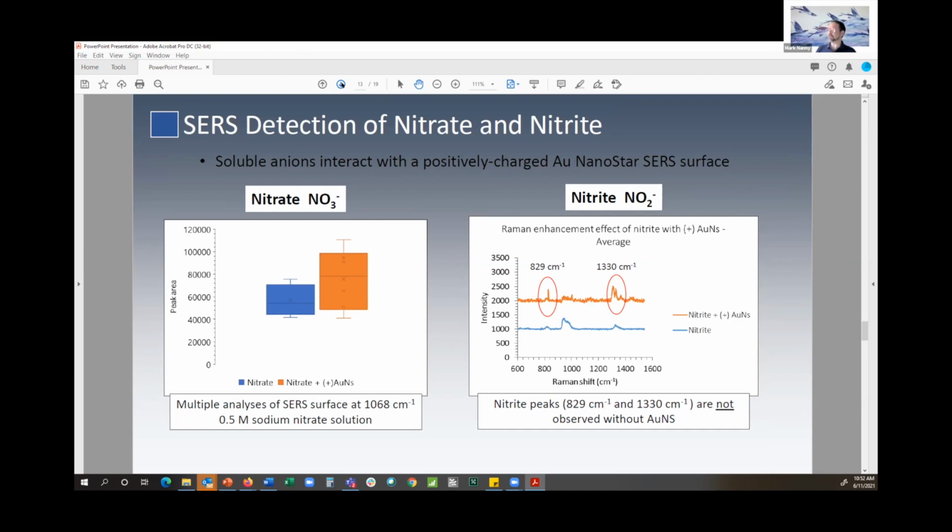So we've also worked with phosphate. Phosphate is a tough one to deal with respect to Raman, because it doesn't give a very strong Raman signal as it is. So we have not had much luck yet with Raman. We also want to try perchlorates, just because perchlorates are an important issue in many areas with respect to groundwater contamination. So that's one example of our work with polyoxy anions. The next area, next slide, please.